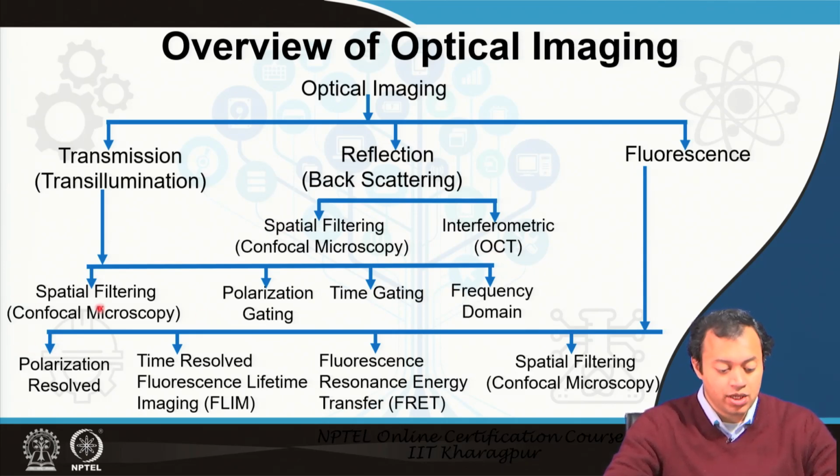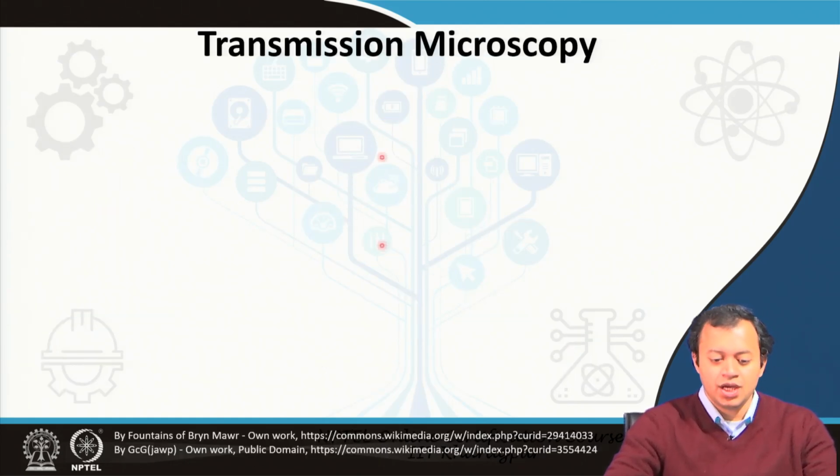A little bit of confocal microscopy and maybe fluorescence resonance energy transfer. I believe a bit of it has already been covered. So, maybe I will talk about LSCM, laser scanning confocal microscopy. So, let us go through it. The very basic is transmission microscopy.